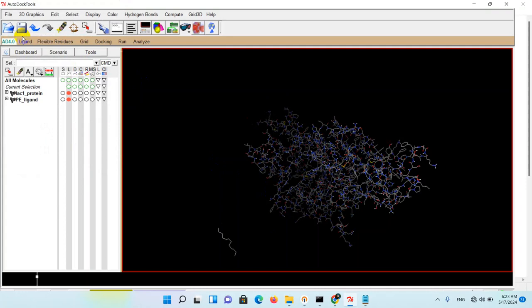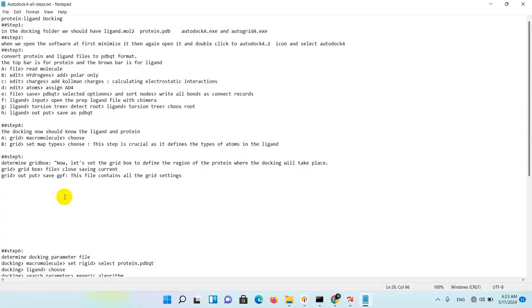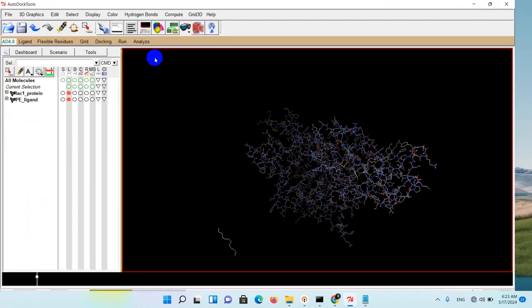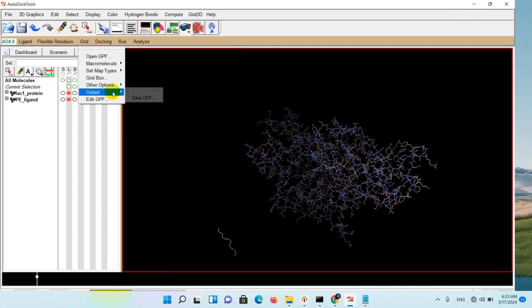In the next step, you need to save all the dimensions of your grid box in a GPF file. The GPF file contains all the grid settings for you. So, read output, save GPF file.